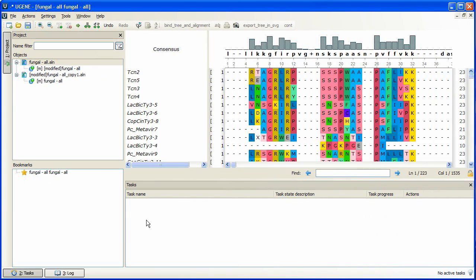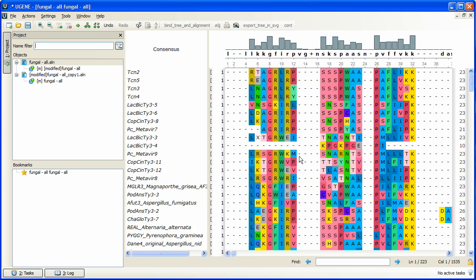The alignment is done, and we can work with it. It consists of sequences of length up to one and a half thousand.